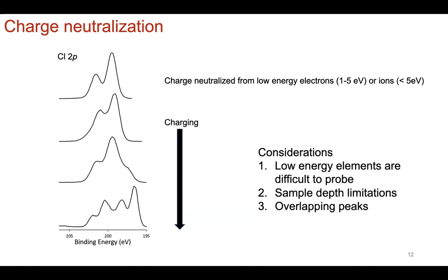Okay. Now, so sample prep is key. Variation in depth will cause you to have different types of signal. The intensities may change. And so in terms of the sample type that you'll have, I think a lot of us will have powder samples that are basically not perfect.